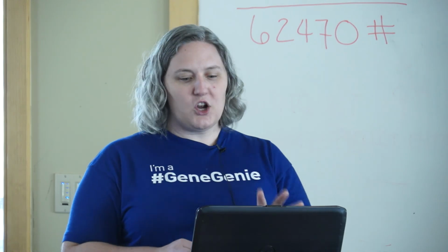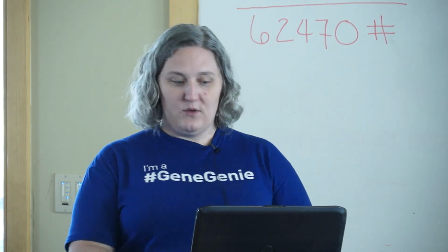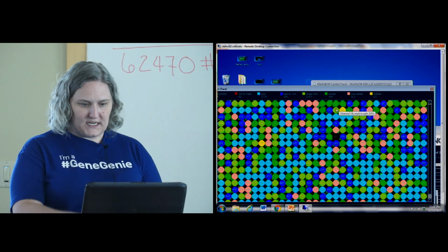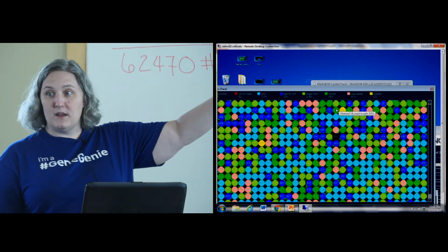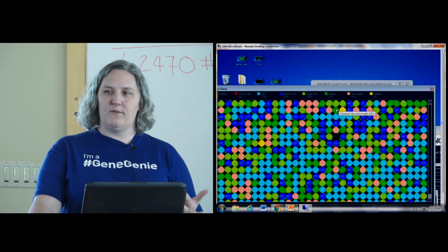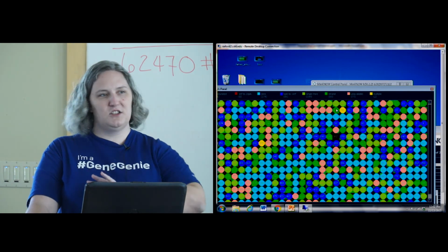So chances are, if I were to find out which pore produced that long read, and you actually can sometimes do that, if you hover over these pores, it tells you the length of the last read generated. If you find that 35,000 pore, you can probably reverse the voltage and unblock it, but you'll probably find there's something wrong with that pore. It's definitely not a real read.